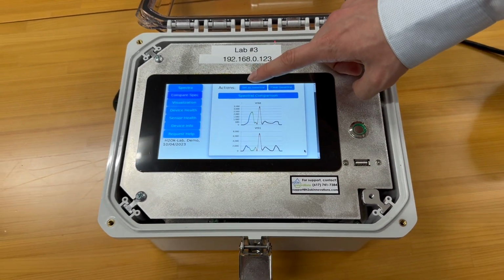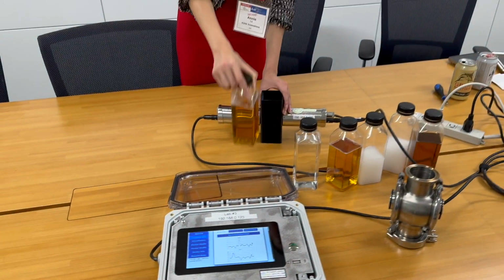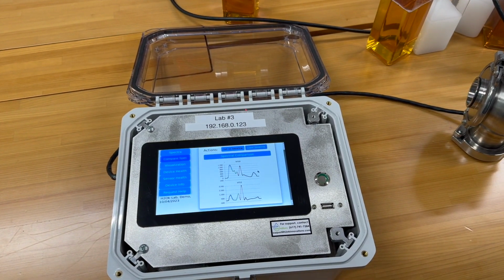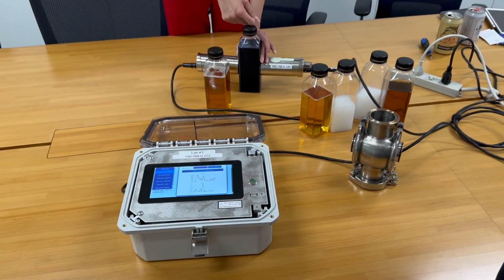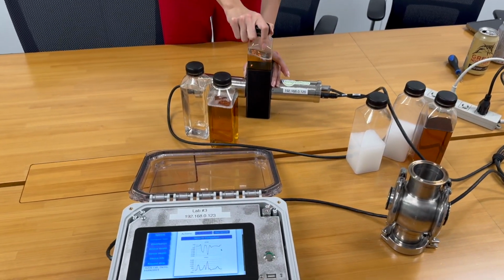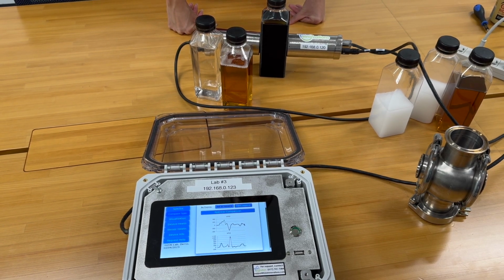Then now I'm going to baseline it to compare different products. I'm just creating two different types of beer, for example. So you have this beer, you finish producing this batch, then you push with water. You want to figure out when do you reach a clean state, when do we reach fully water? That's the difference between beer 1 and water. So check the difference between beer and water in a changeover process, for example. And then we're going to start pushing this beer. When do we reach good quality for this new beer that we're creating in this changeover? You see, that is the difference between beer 1 and beer 2 that the H2OK system is detecting.